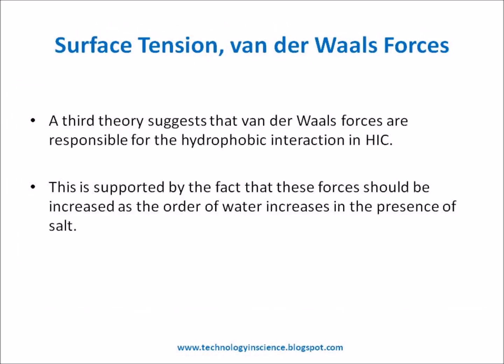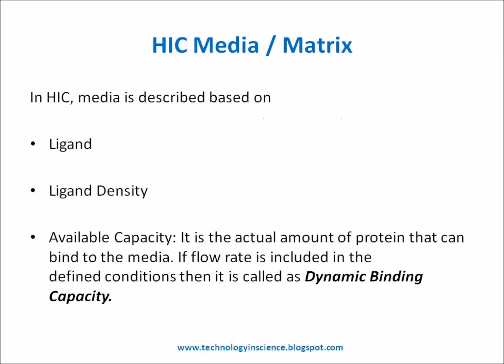Surface tension, van der Waals forces theory. A third theory suggests that van der Waals forces are responsible for the hydrophobic interaction in hydrophobic interaction chromatography. This is supported by the fact that these forces should be increased as the order of water increases, in the presence of salt.